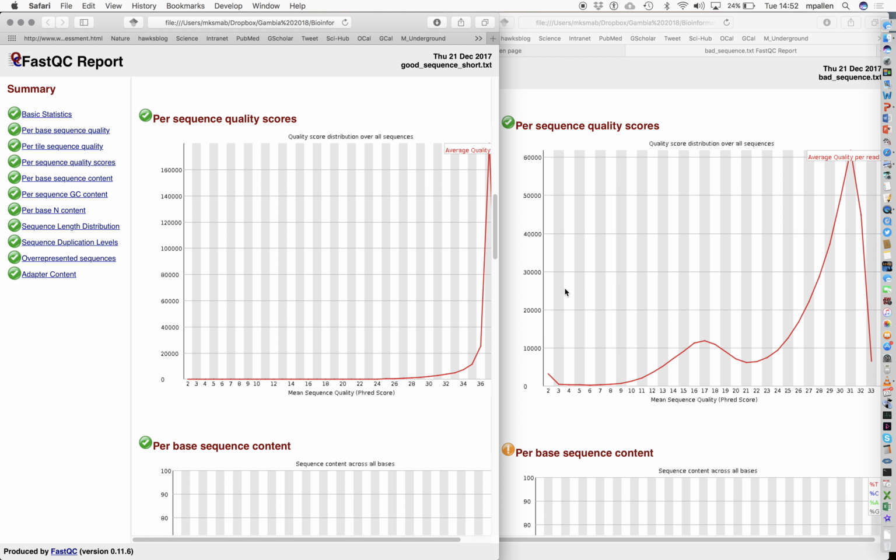Another demonstration of the quality scores. It's not always looking at quality scores, but in this case, it's looking at the data sort of flipped around the other way. So rather than looking at each individual base call, you now have the quality score along the bottom and the number of reads on the y-axis that have an average quality score of 30, 32, whatever.